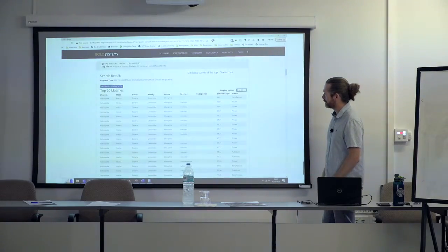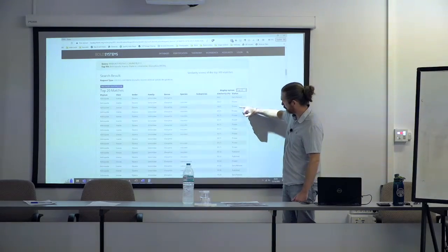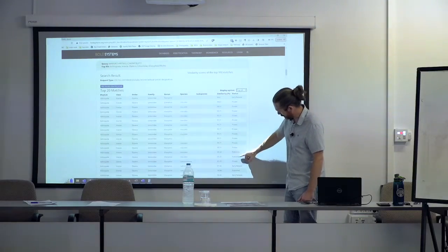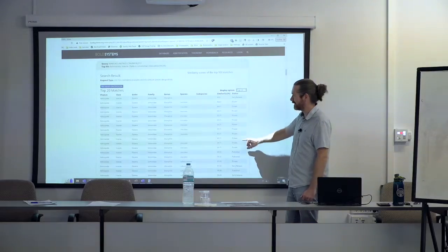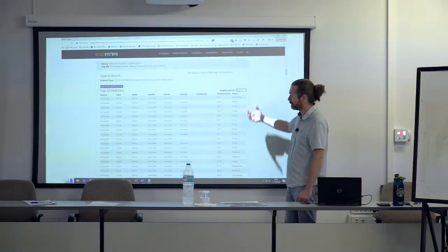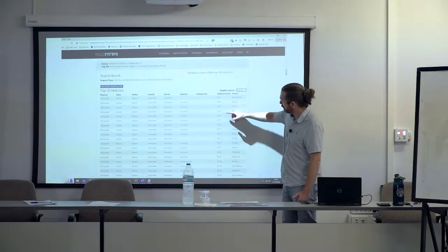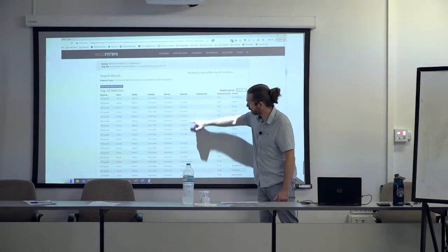So here's an example. It's telling us all of the hits here, whether or not they're early release, if they're private, if they're published. Look at that, private, published, private. Yeah, not a lot of published data on Bold, which is not great. Published as in publicly available. And you can also see that there are really good hits, 99.6% here, to species level identified things.